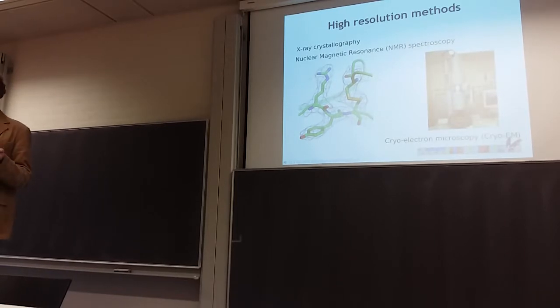Does anybody, except the chemist here at the front row, know roughly the size of a carbon atom? What scale are we thinking of? Angstroms? How many? I think the diameter is about 3 angstroms.